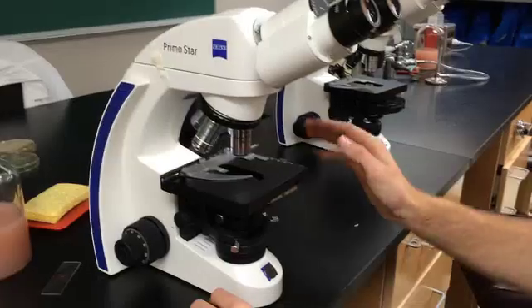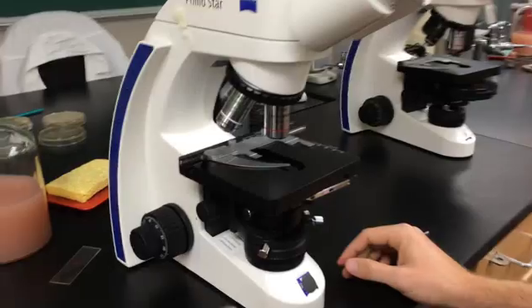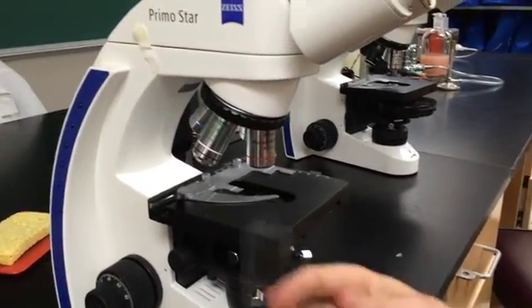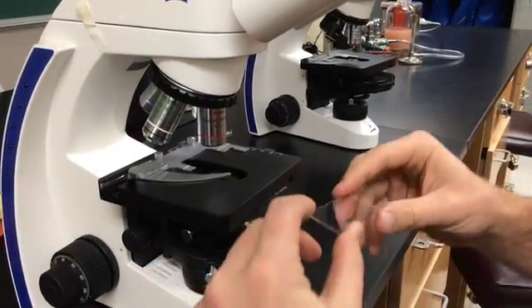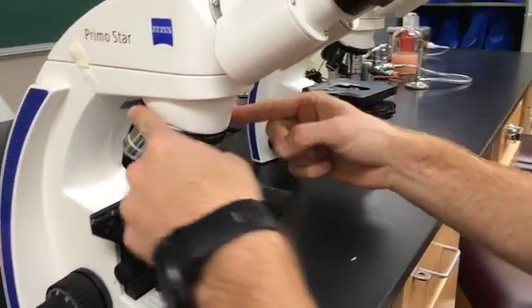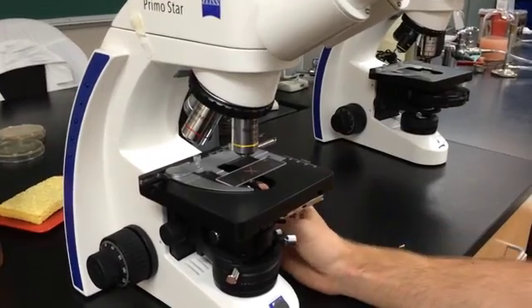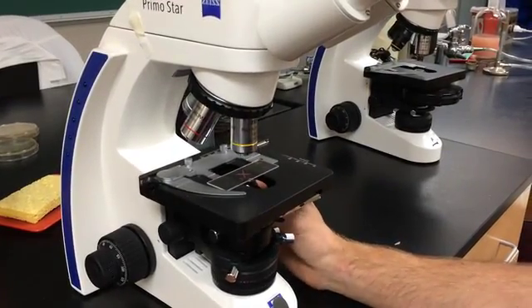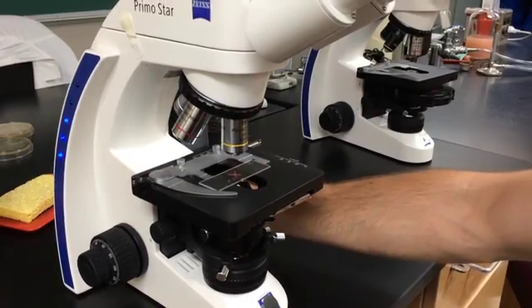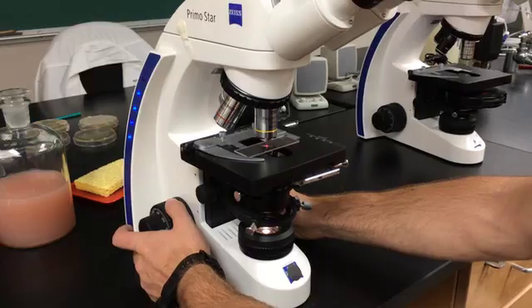So when you pull out the scope, the stage is all the way down and the lowest objective is in place. What you do at this point is you take your X wax slide or whatever you have, you put it in place, and you turn it to the 10X objective. We don't actually really work with the 4X objective at all. I'm going to center my X. I'm going to turn on my scope so that light is coming through. There's the light. And now I'm going to raise my stage all the way up.